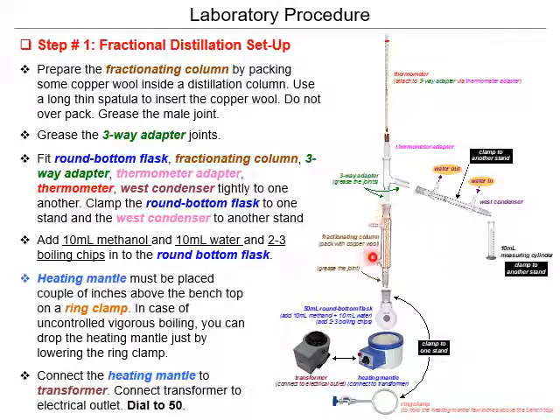It's kind of rudimentary, but this is just a teaching lab, so this is what you would do. You would not use any sophisticated equipment. Keep in mind that the methanol and the water are in a 1-to-1 ratio. That's important for your graph taking, right? Probably in the quiz too.